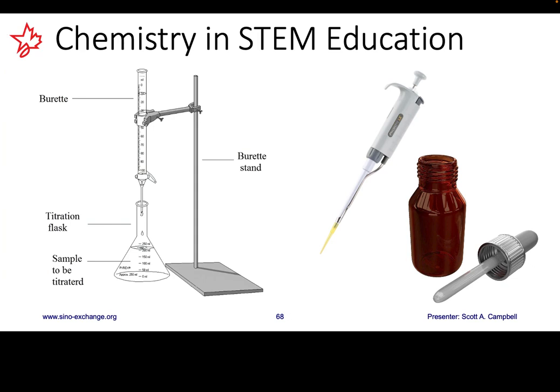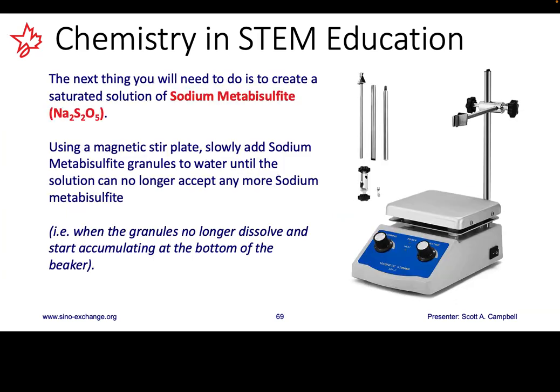At this point, the gold will start dissolving and you'll see red nitrogen dioxide fumes. Please make sure that you avoid breathing these fumes in. Once all the gold has been dissolved, filter the solution again, removing any bits of fiberglass and plastic from the solution. Be sure to thoroughly rinse your beaker, funnel, and filter with water until the solution runs clear, as the residue will contain gold.